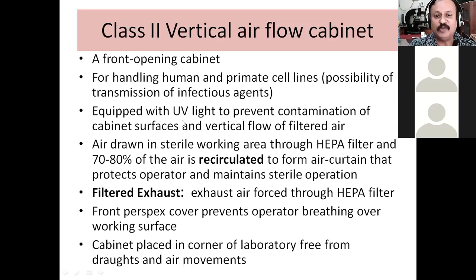This is also equipped with UV light. Then it has HEPA filters. So these are common things for all the laminar airflow cabinets, especially which are used for microbiology work. And then look at this point here. Air is drawn in the sterile area through HEPA filter, and about 70 to 80% of that air which is flowing through the cabinet is recirculated. And that air will form an air curtain. This air curtain is something which will protect the operator because air is flowing from top to down. It is not coming over the face of the operator, and therefore the operator is protected.